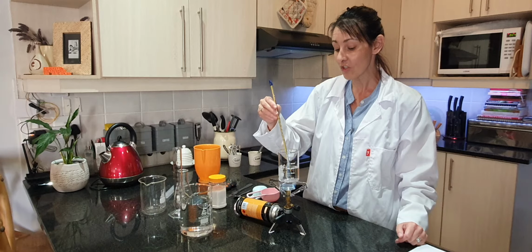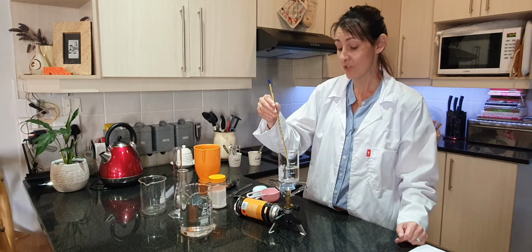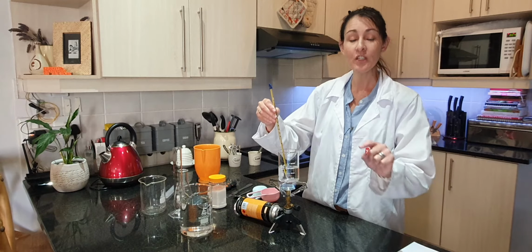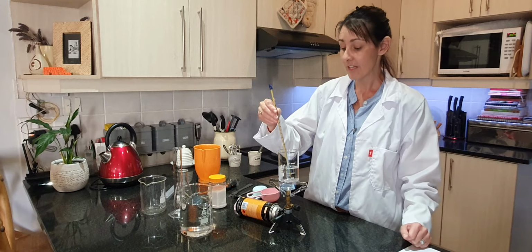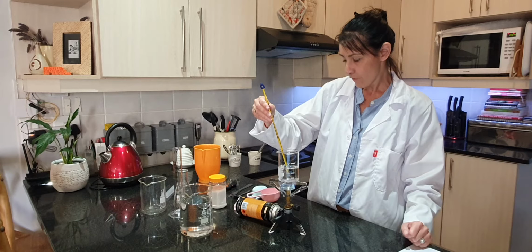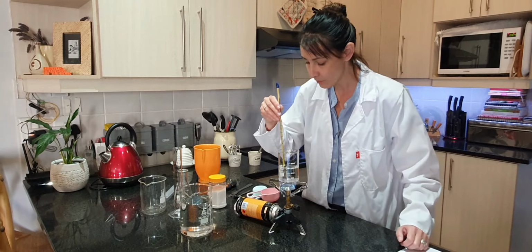Once this liquid starts to make bubbles, it means that its boiling point has been reached. It's starting to boil, and that temperature I will give to you, and that's the temperature that needs to go into your result table that is in your practical just below the method. We are now on 47 degrees. Stirring it a little bit more.